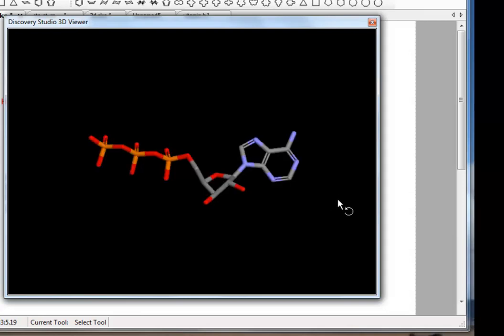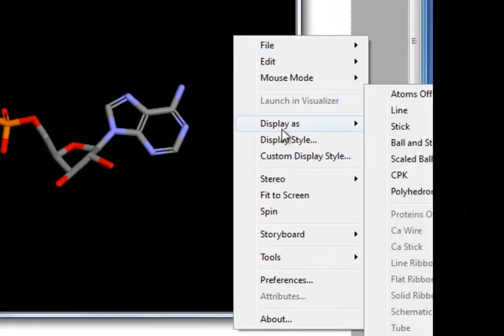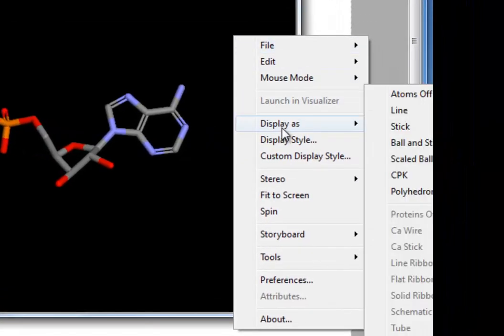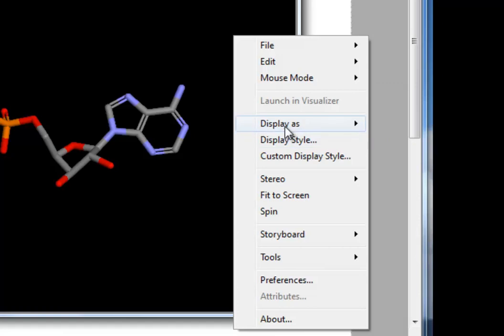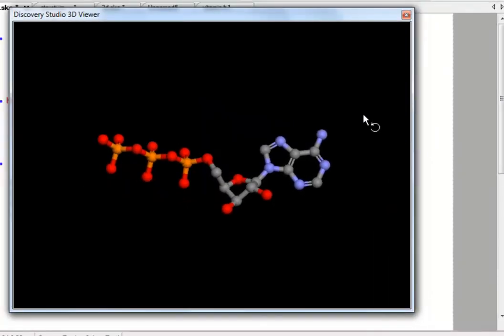At the moment it looks a bit unfamiliar — we don't appear to have any bobbly bits indicating atoms, and we seem to have bonds which are half one color and half another. If we right-click, a menu appears and we go to Display. There are a number of different options here. Go to Ball and Stick — this displays ball and stick, and we see the familiar little bobbles indicating atoms appear again.